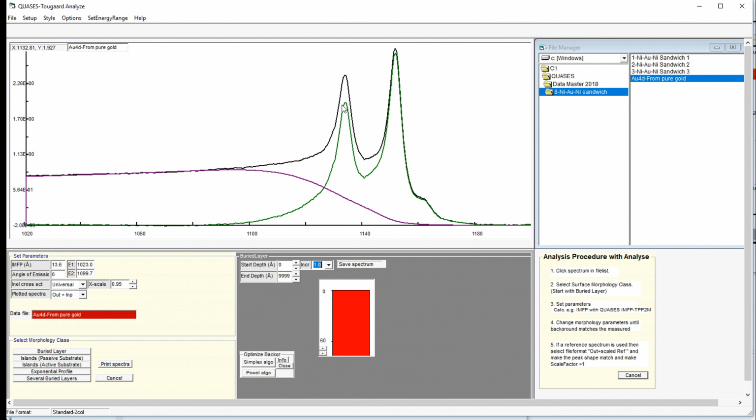So when you do analysis of an unknown sample, you should get the exact same intensity and shape as we have here. Shape may be slightly different if you have some chemical effects going on the low energy side, but the intensity must be the same. So we save this and overlay it with the spectra that we analyzed later on.